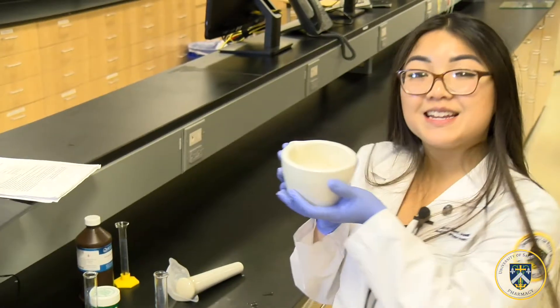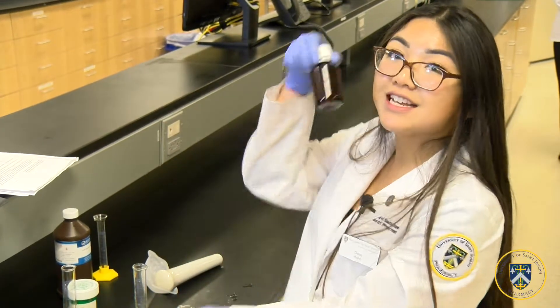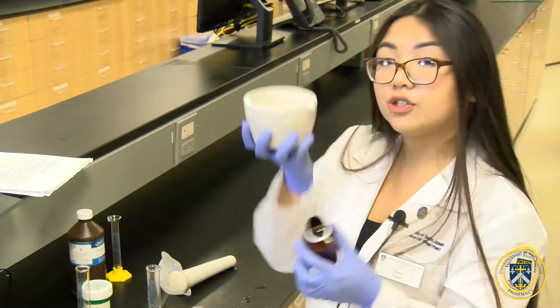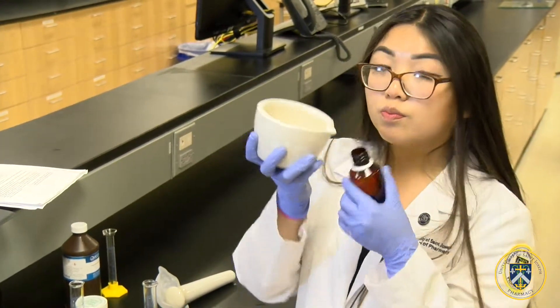Now that you've added quantity sufficient up to 60 milliliters, you're going to pour it into the amber colored vial. Make sure you get every last drop of emulsion — you can use a spatula to scoop it in.